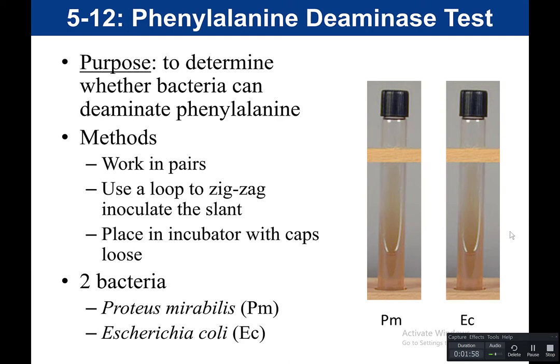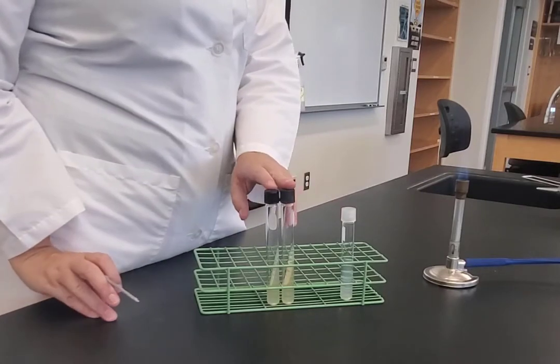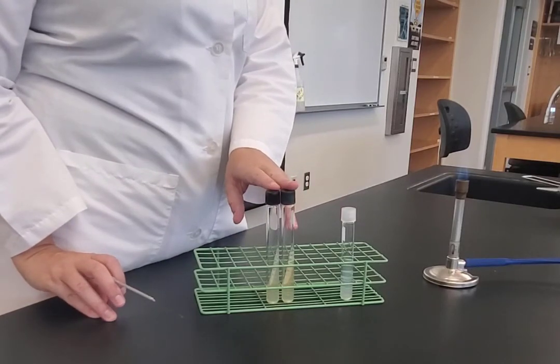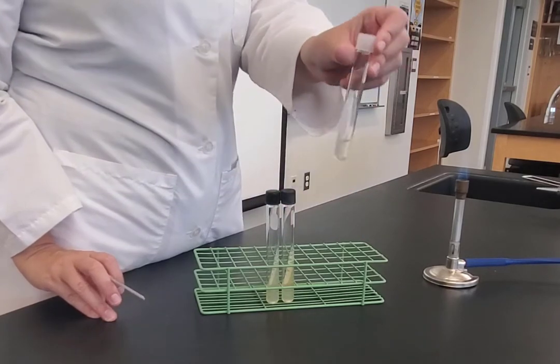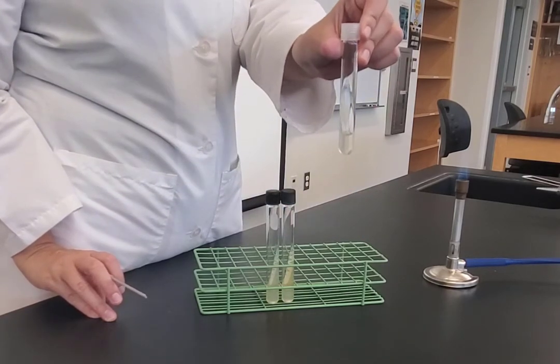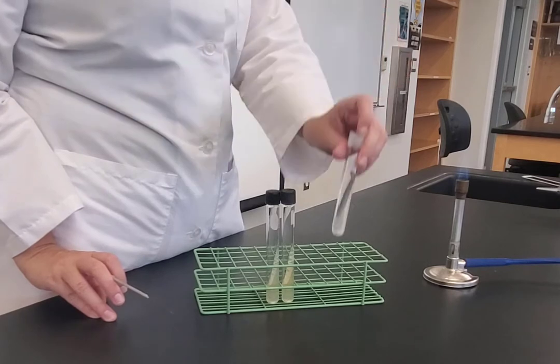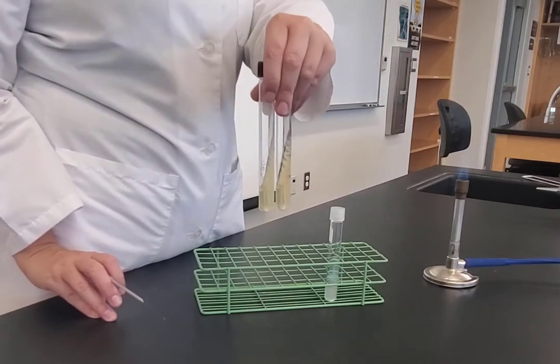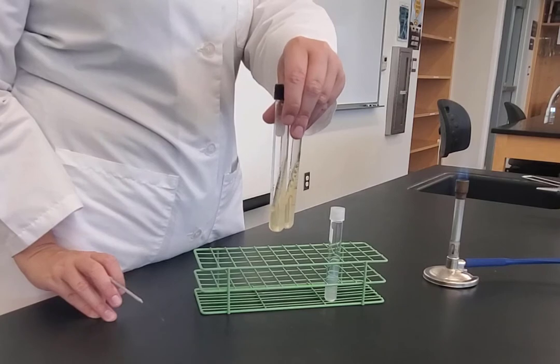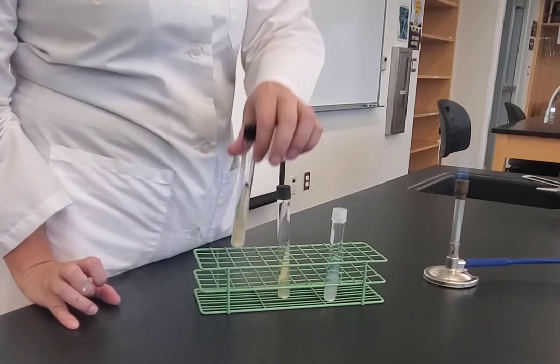Here's a video showing how to do this. In this experiment, this is going to be a phenylalanine deaminase test. What I have is a phenylalanine slant, which contains the amino acid phenylalanine. There are two bacteria that are going to be used: E. coli and Proteus mirabilis.